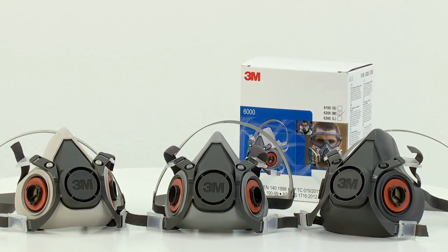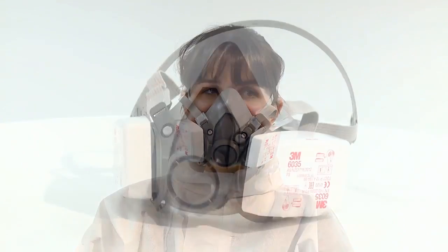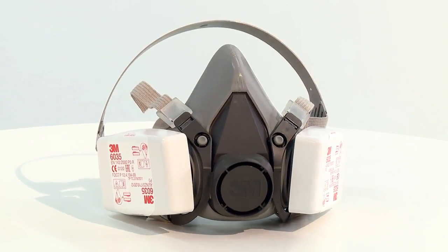Hello and welcome to this video demonstration of how to correctly fit the 3M 6000 series reusable respirators. Jen will now demonstrate how to fit the medium 6200 respirator. The procedure also covers the 6100 small and the 6300 large models.